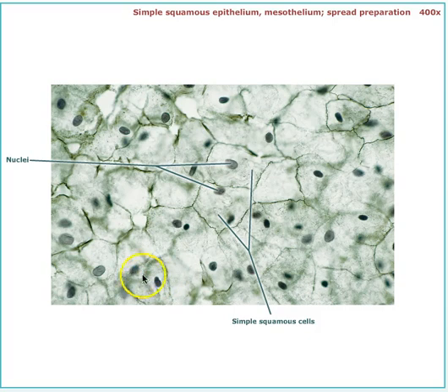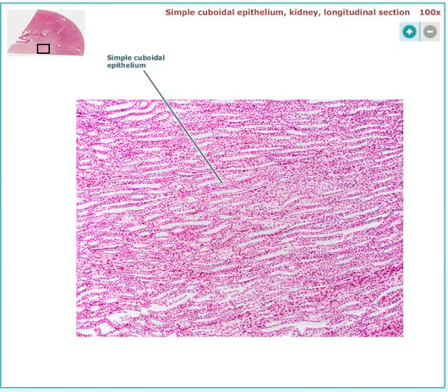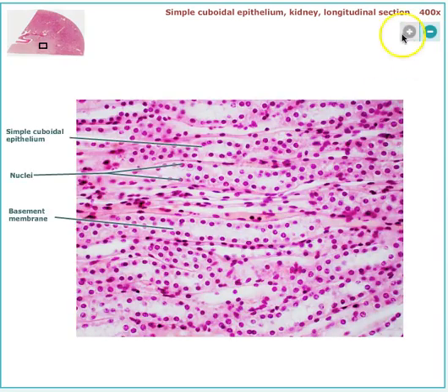Over here we see more of the simple squamous cells. And we'll zoom in here. More simple cuboidal. Look at that. It has this opening here in the middle. And you see the nucleus is taking up most of the cell. It's one layer, so this is simple cuboidal.